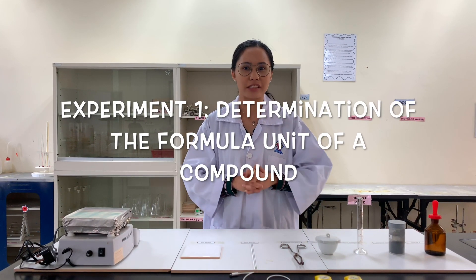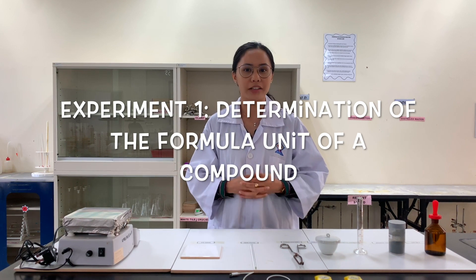Hi students! This is experiment 1, which is the determination of the formula unit of a compound.